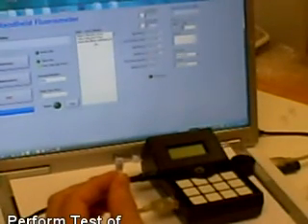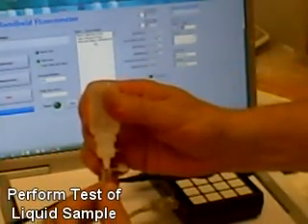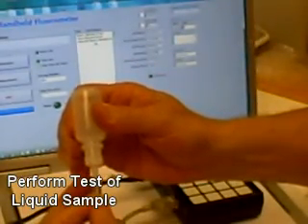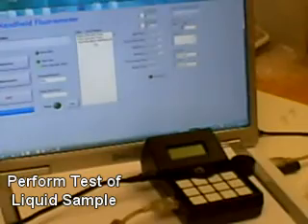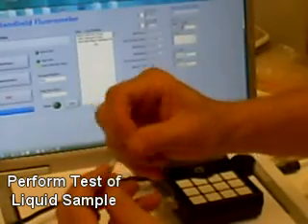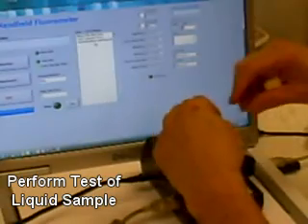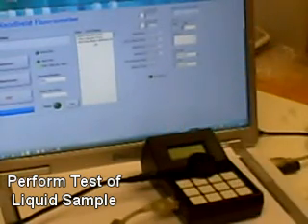Now you're ready for your testing. Take the water that you wish to sample for your testing and add three drops to the cuvette. Next, add three drops of the reagent to the cuvette. Close the lid and mix well by shaking gently. Once mixed, wipe off the cuvette with the tissue to remove any oils and insert the testing cuvette into the reaction chamber. And click on the measurement button.